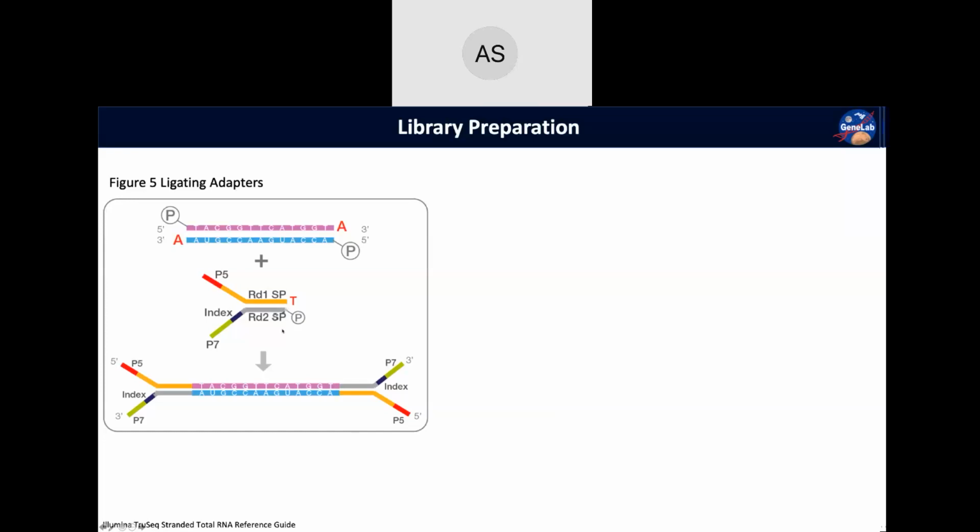Loose adapters that aren't bound to your region of interest are a nightmare in sequencing. It actually causes a whole mess of problems. So right now at this step, after we add on the adapters, it undergoes a filtering step to size select, so that way you remove any of these adapters that are still floating around in your solution.